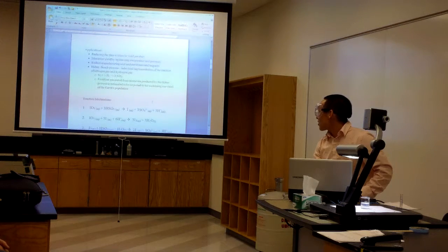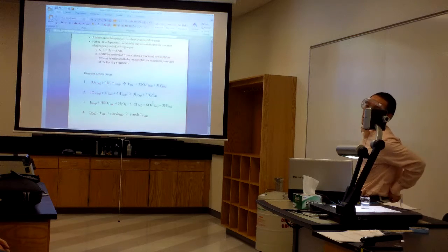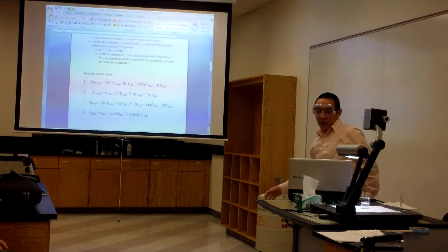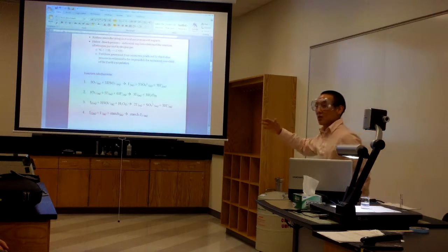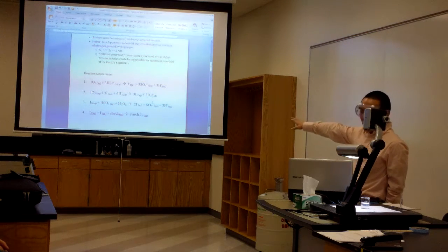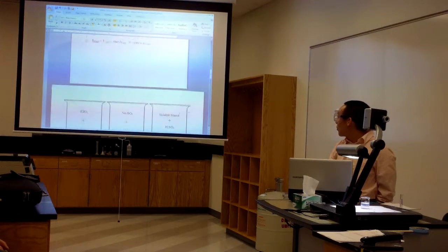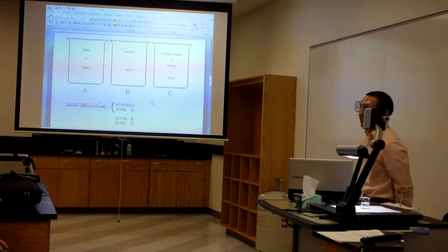All right. So for this reaction, these are the reaction mechanisms, which are kind of like the elementary reaction steps for the whole process. There's another version of this iodine clock reaction that's an oscillating reaction, which has 25 more steps. This is the simpler version. Based off of this, I have an illustration here because it might not make sense for all the non-chemistry people. That's kind of what it looks like.